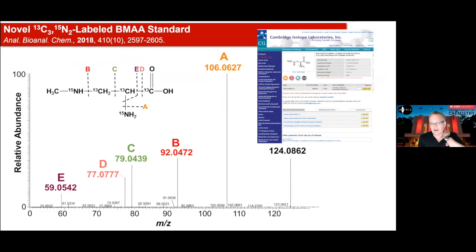I will tell you, and it's not against Josh Pierce, he's not an amino acid chemist, and so I went to CIL and I asked them, "Can you make this for us?" Because I think the field really needs it to rule in or rule out this hypothesis, because the material that Josh made was chemically and isotopically not so pure. So CIL made the molecule. You can buy it today, and I urge people when they're doing studies with BMAA to use this standard, because at least we can try to get reproducible results and find out what's really going on inside of bacterial blooms.